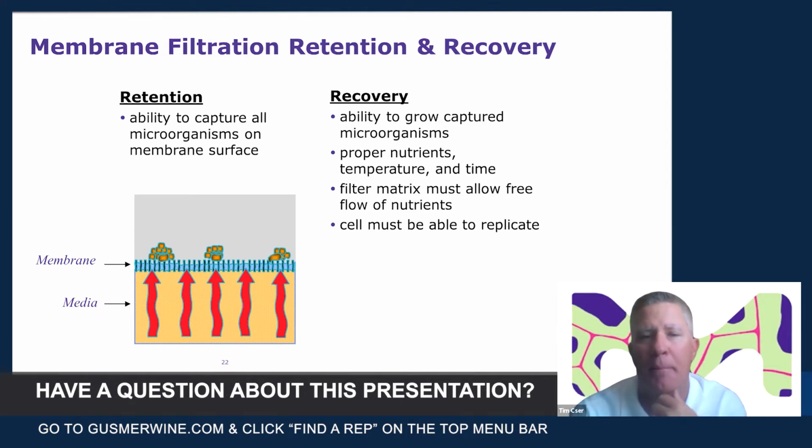For an example, again, in that paper, a 0.22 micron filter is considered a sterilizing grade filter, but the media doesn't come through the pores as quickly or as easily, so the bugs don't grow as large. So those are the 2 things that we need to balance when we do membrane filtration, which is why we settle on 0.45 micron. Next slide.